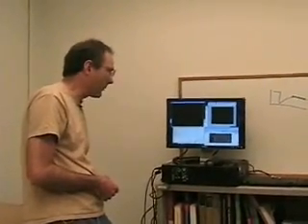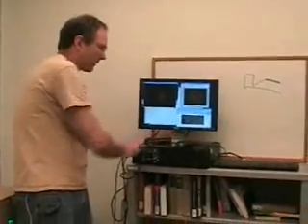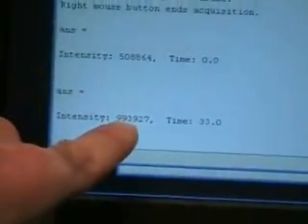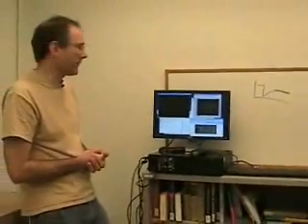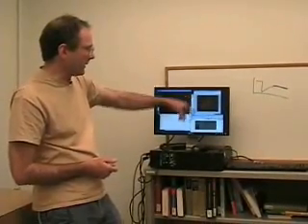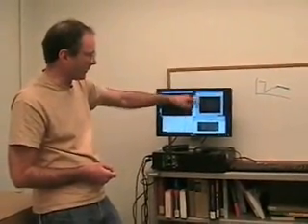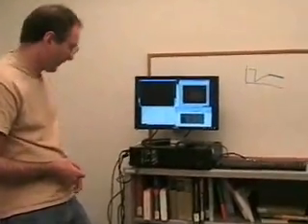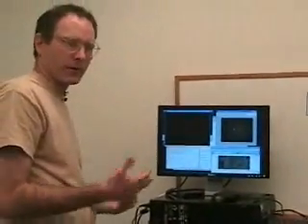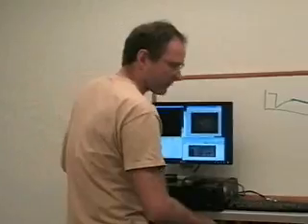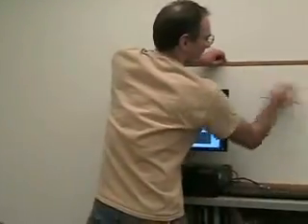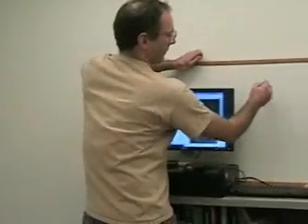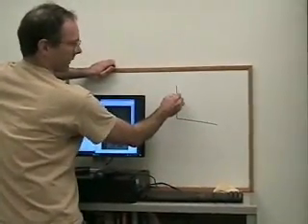And if I now open the shutter, you can see the beam. I'll click. I'm going to close the shutter so I don't bleach any more than I need to. But I've now acquired this, and that turns out to be 993,000 counts. So my signal is 500,000 counts above background roughly. And this is a blown up area of what I was looking at. You can even see some of the diffraction rings. So it's nice to have several data points to illuminate your FRAP data set.